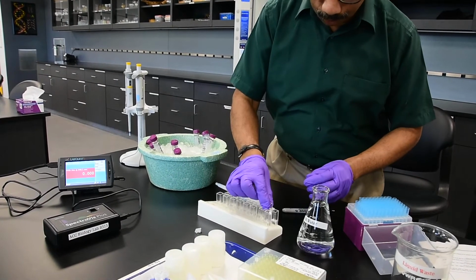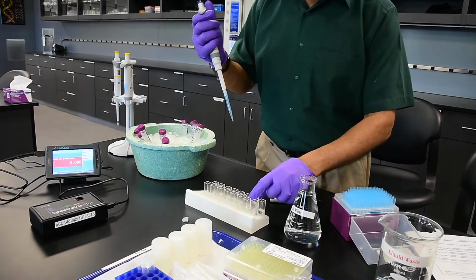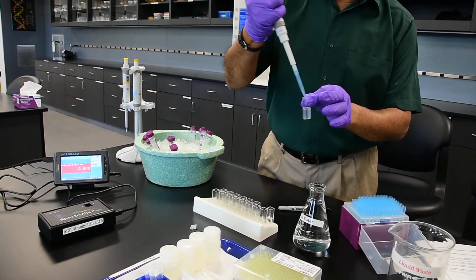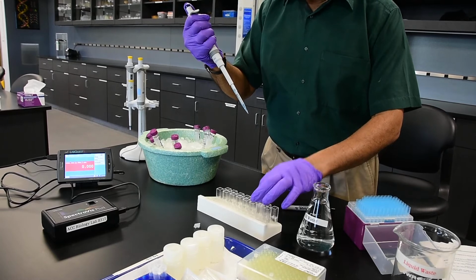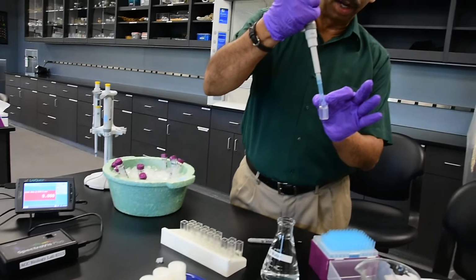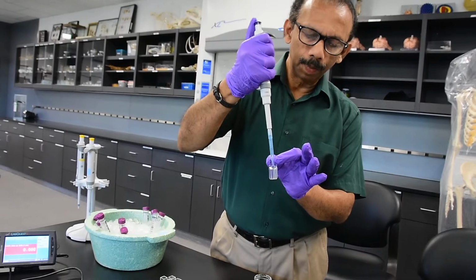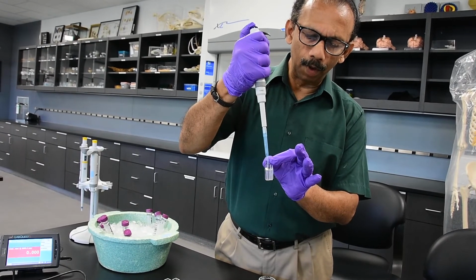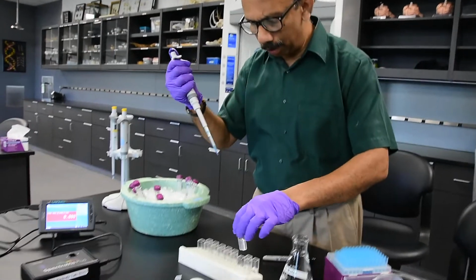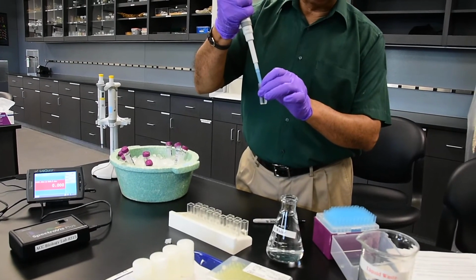Now I have to do the next milliliters, and so this is 2 ml. I'm taking 1 ml from this and going to the third one, and in the same way I am pipetting in and out to mix this. So this has mixed evenly well, and now I take 1 ml from this and then go to the next cuvette. So this is what is referred to as a serial dilution.